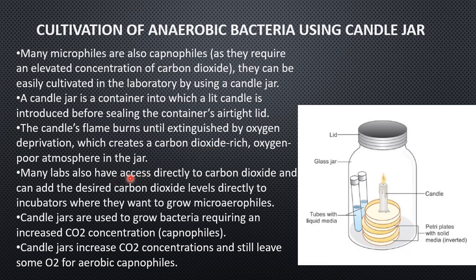Many labs also have access directly to carbon dioxide and can add the desired carbon dioxide levels directly to the incubator if they want to grow microaerophiles. If you have that facility, you can directly introduce the carbon dioxide into your incubators and maintain the levels.